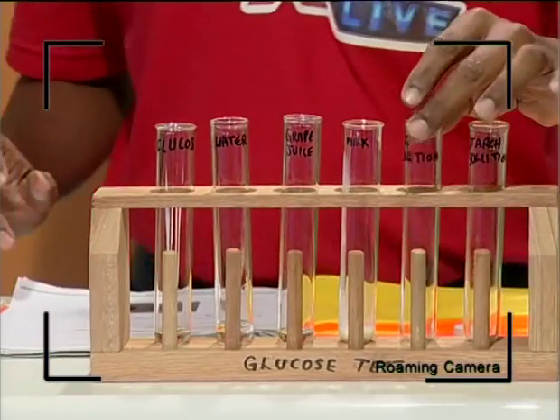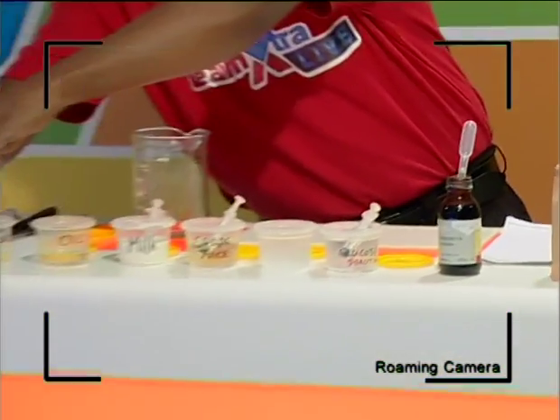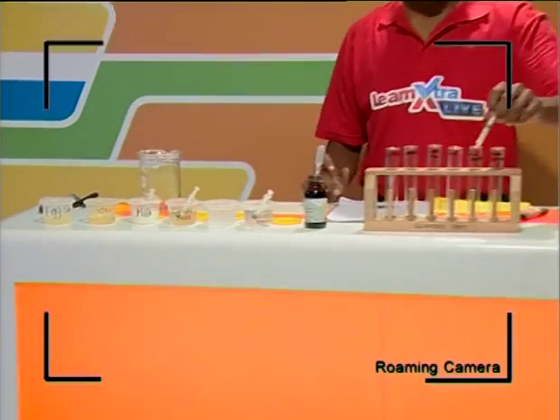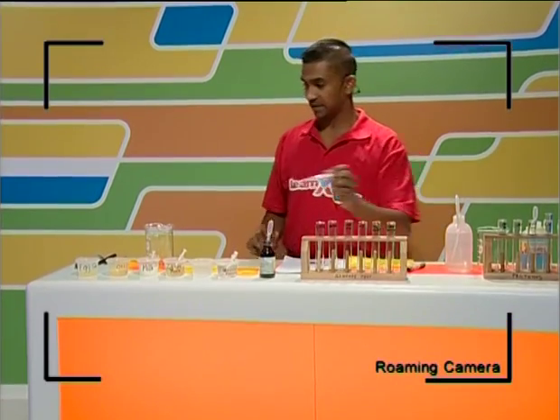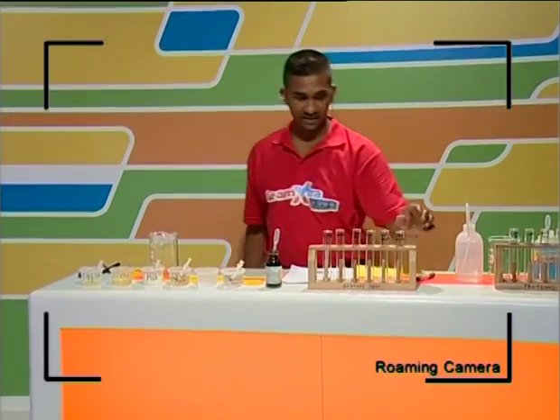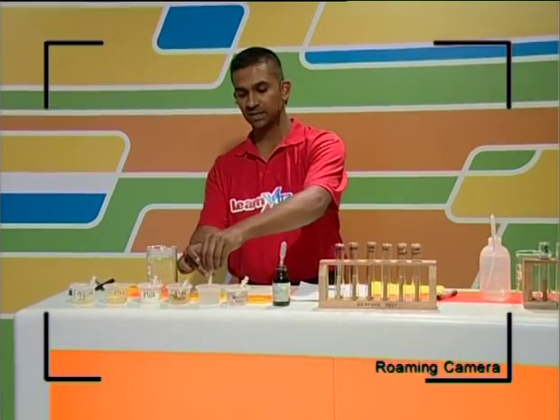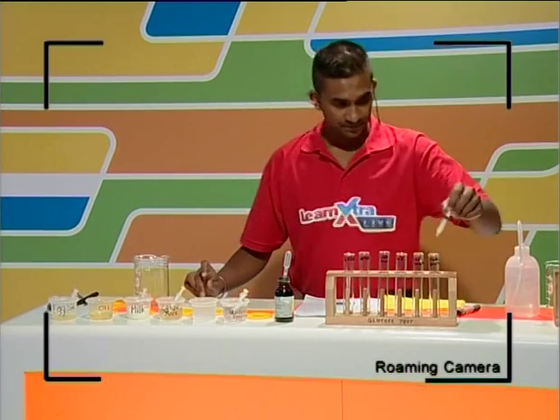And the next one is an egg solution, guys. And I know that eggs are very important. They're important as a source of protein, and hence you know why that's in your diet. So it's very important to sustain your protein needs by having lots of eggs. And obviously the last one is a starch solution, guys, and we know the value of starch as well. We see that coming from the potatoes that you eat. Let's look at these now.